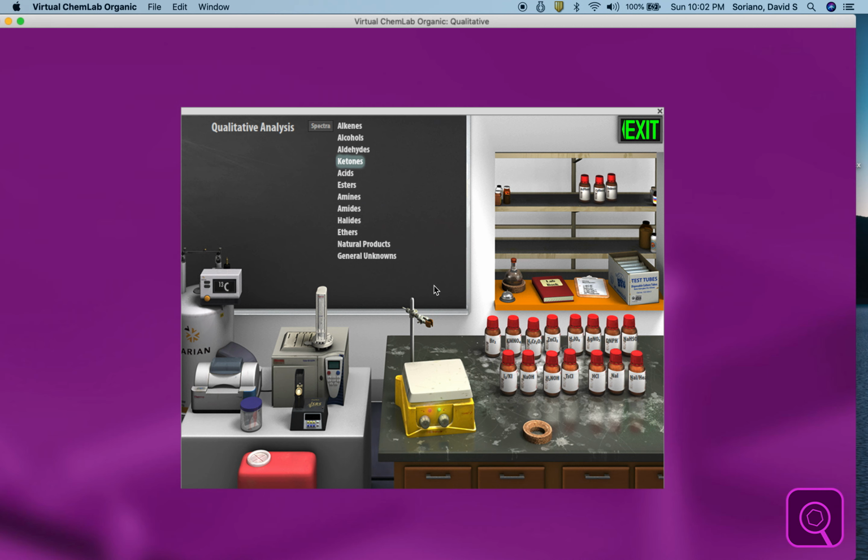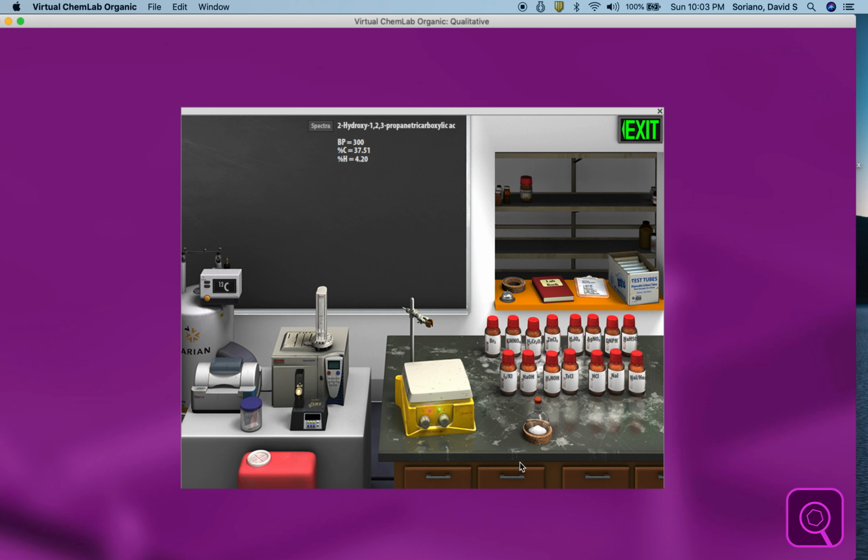and let's take a natural product. And that is citric acid. So we'll put a sample in there. Notice it's a solid. Let's do the melting point of this. So what we'll do is take a sample over. If I can line it up nicely.